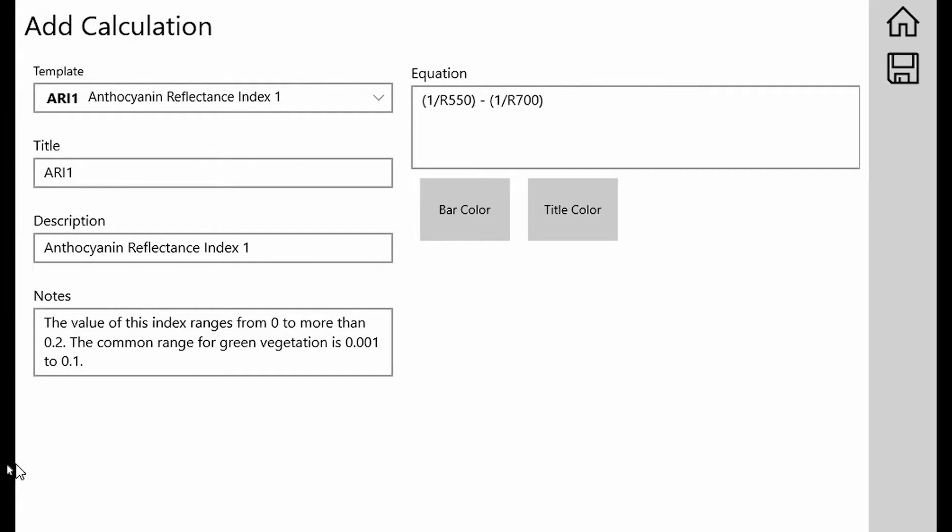The notes here will tell you something about the index. Usually it'll give you something like the typical values you might see or even the paper that we pulled the index from. And then over here, which is another important part, is the equation showing you how the actual index is being calculated. This index in particular is the inverse of the reflectance at 550 nanometers minus the inverse of the reflectance at 700 nanometers.